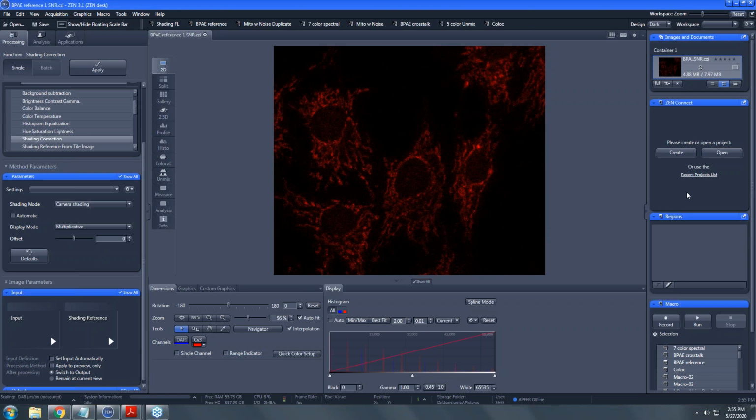I have done spectral unmixing on plants, which can be quite challenging, and the plant has a response to light. As you're imaging it, you can see the spectra of the chromophores in the plant changing their shape in response to the fact they're imaging them, which adds another layer of complexity to doing this spectral unmixing, of course. Okay.